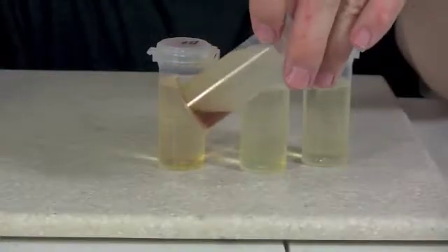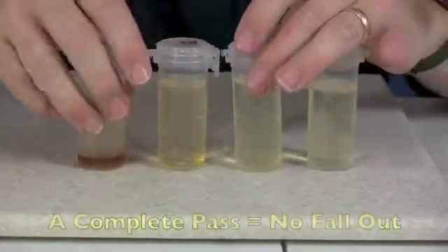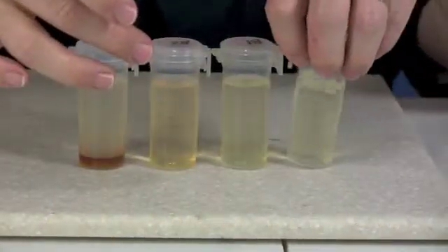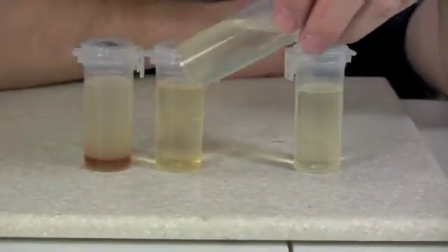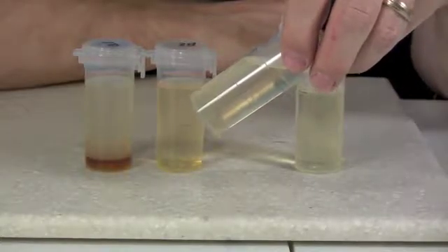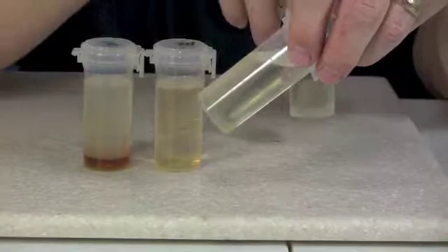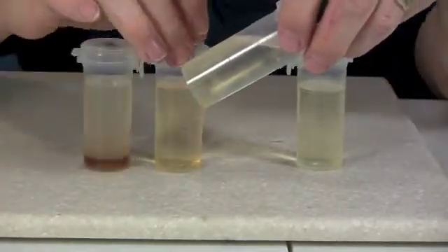And then you have just standard oil that hasn't been reacted at all. To pass this test, you want your fuel to look completely clear — absolutely no fallout on the bottom. If you have some fallout on the bottom, can you burn it? The answer is yes, because a diesel engine can burn vegetable oil. But if you're trying to burn completely reacted biodiesel, you want fuel that has a complete reaction. So this test, while there's just a tiny little sliver of fuel, it still doesn't pass.